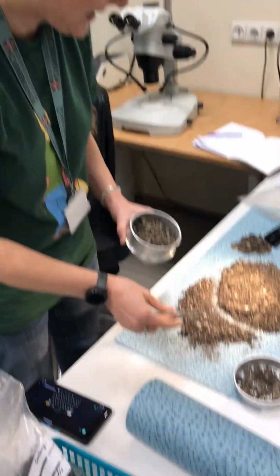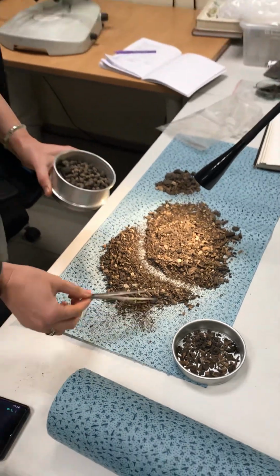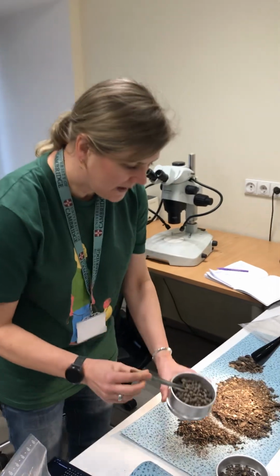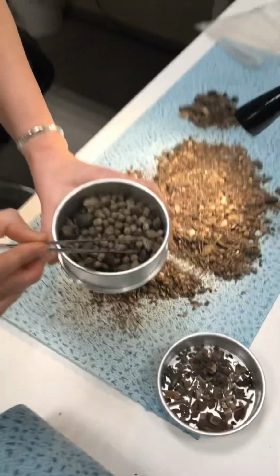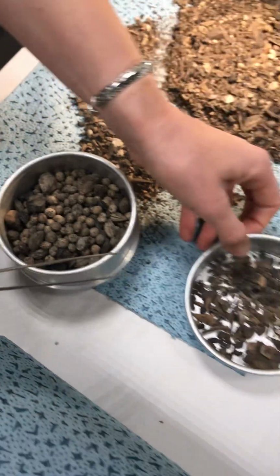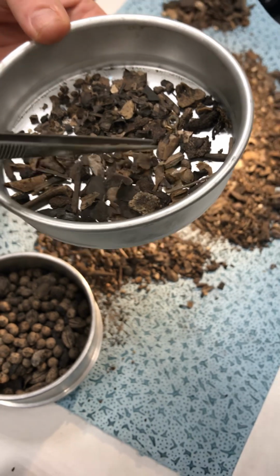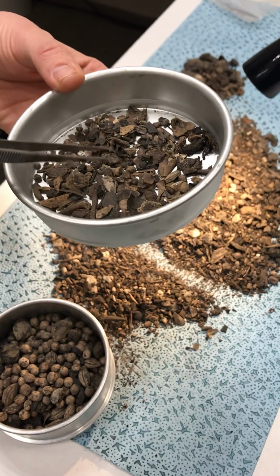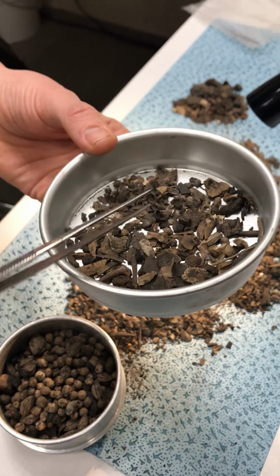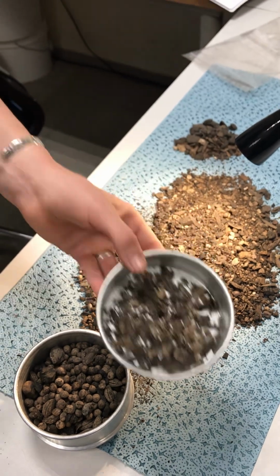So this is a sample from 16th century Vilnius Old Town. It was excavated at about maybe 3 meters deep in a trench. Here you can zoom in, you see there are plums, cherries, different kinds of plants. Here, for instance, a smaller one, like hazelnuts. This is Camelina sativa. There are apples, some rat bones, fish bones. You see this vertebra of a fish. It's anything people left behind, and because it's waterlogged, it's really very well preserved.